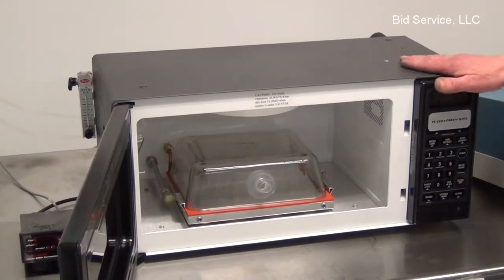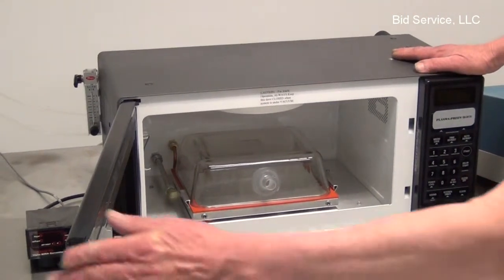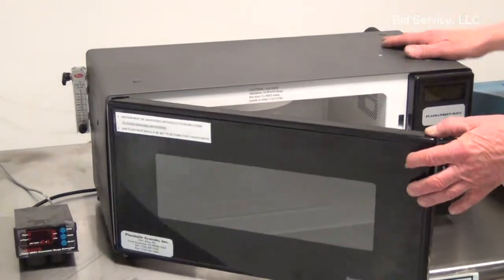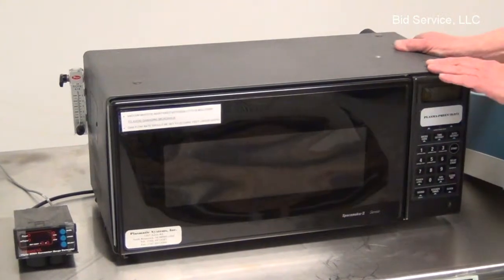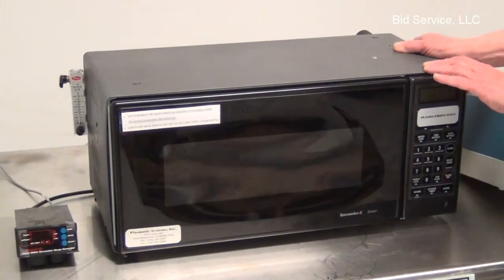What they did to alter the piece of equipment in order to make it usable as a more high-technology piece of equipment is they made a number of connections in the back as well.